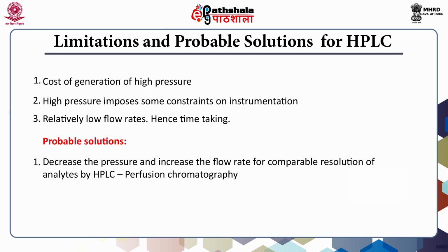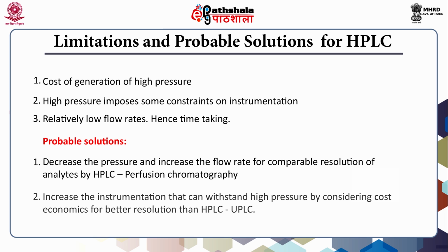Another solution for these limitations is increasing the instrumentation that can withstand high pressure, by considering cost economics, for better resolution than HPLC. One of the alternatives of this kind is UPLC, and this is another alternative format of HPLC.